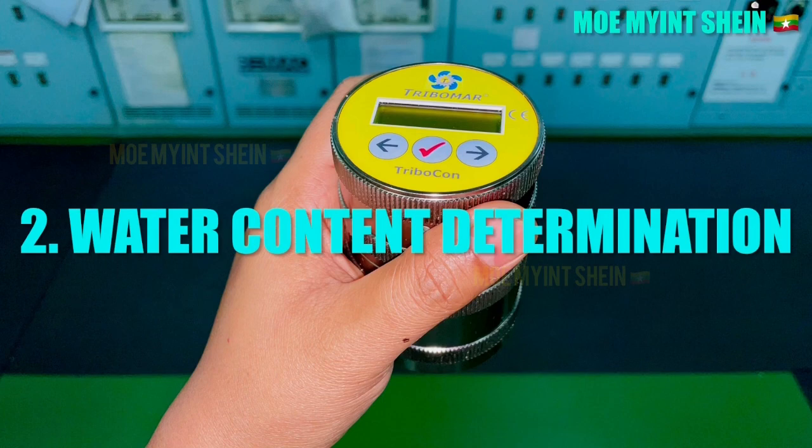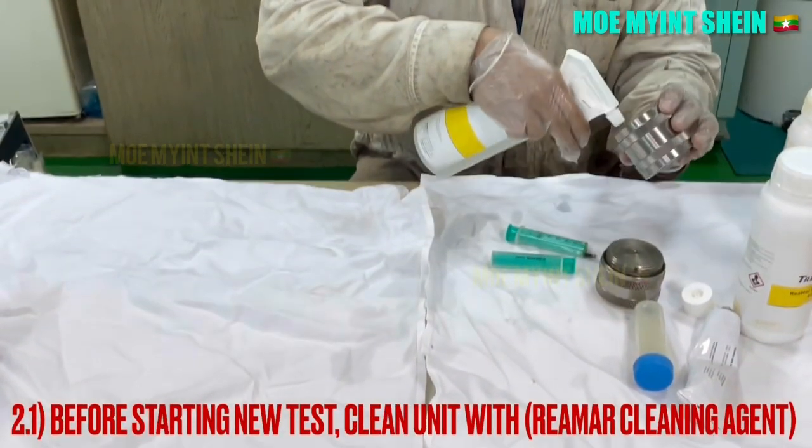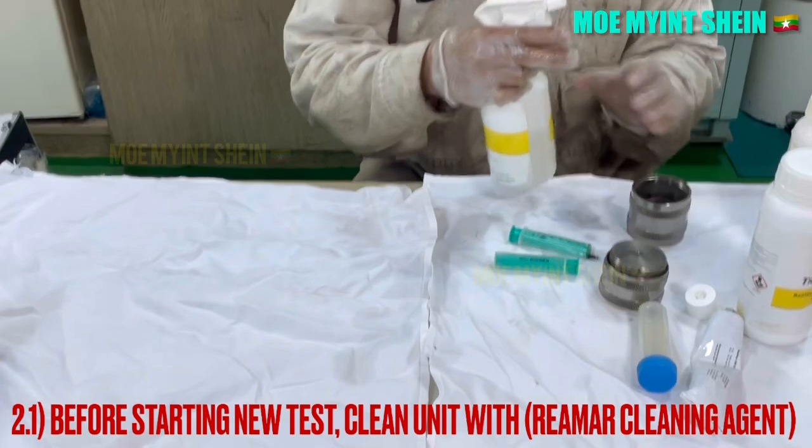Now you will see how to test the water content of lube oil. Before starting any new test, clean the unit with REMR cleaning agent.